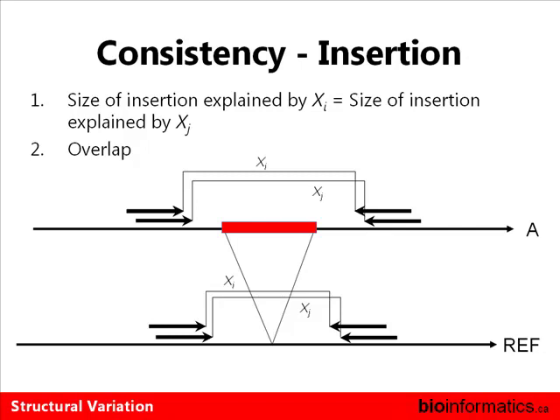I mean, either from bad mapping, or it could be that there has actually been an alteration of the DNA during sequencing. There could have been a recombination event which happened during the sequencing process, which wasn't in the original genome. So no, a single read you definitely would not think would support an event. It comes down to the fact that whenever you're looking for very rare events, you really want to be confident, and even small false positive rates blow up in your face.